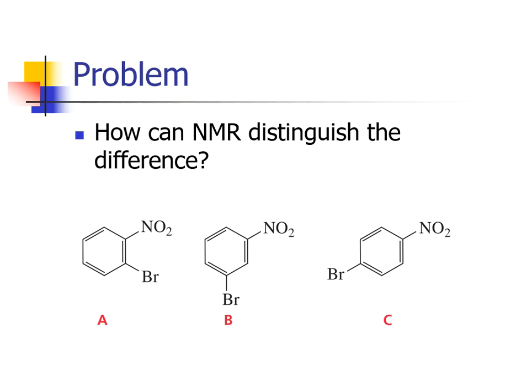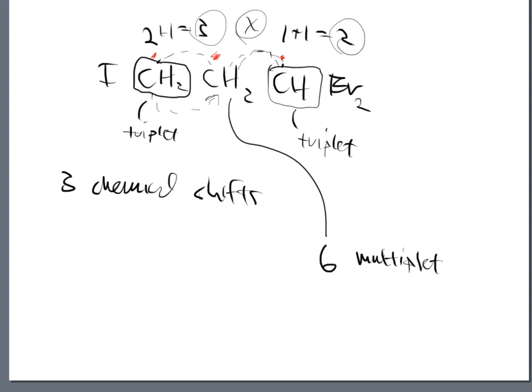And we have just really lengthily discussed the whole concept of the number of chemical shifts, as well as how they split. And now we've thrown in things like doublet of doublets as well. Those are extra little things that we want to watch out for when they decide to happen, if they do happen. So A, B, and C, that's the name of the game with this example problem. And let's use what we have learned already in all of these other examples to figure out how to answer these questions.